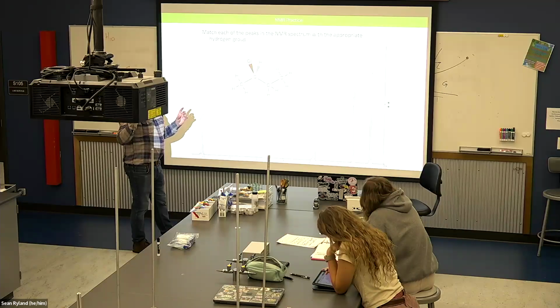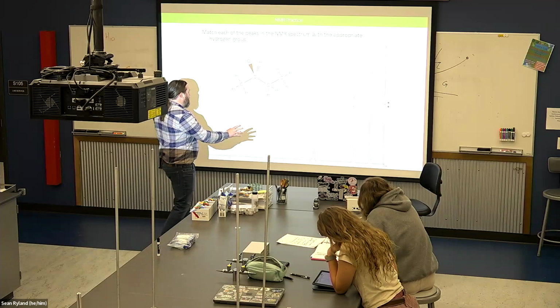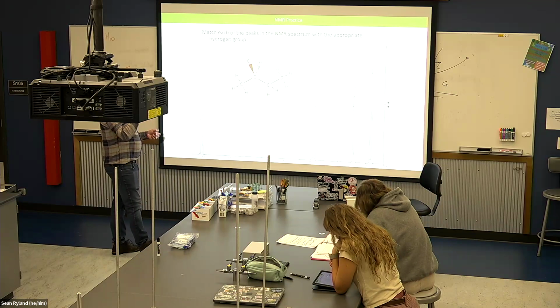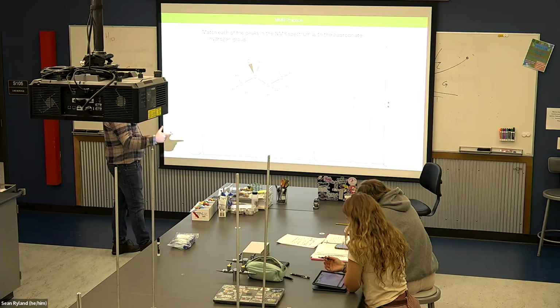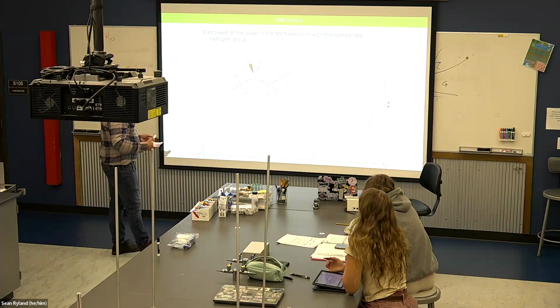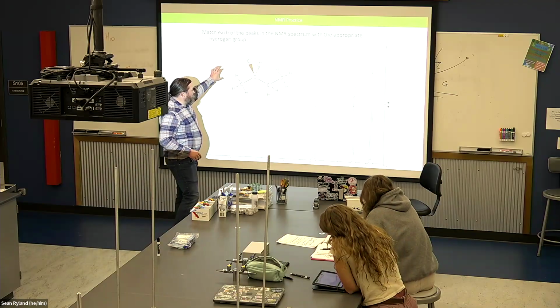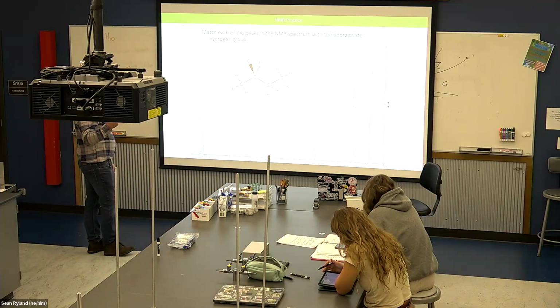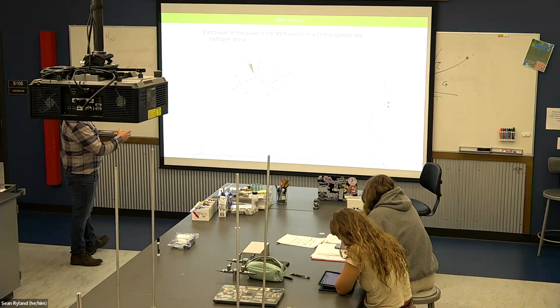And all of these pieces should work together. We're just talking about peak splitting right now. This is a nice, clean NMR where you can tell the peak splitting really obviously, but the integration and the shielding should all match up as well. Looking at this structure, which hydrogen is going to be the most de-shielded? So have the least electron density, so be the most partial positive.